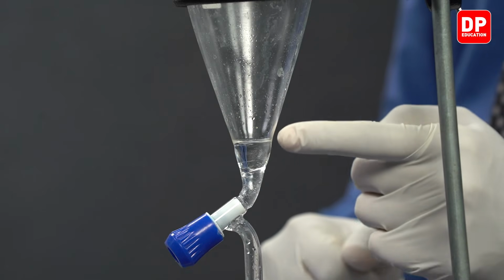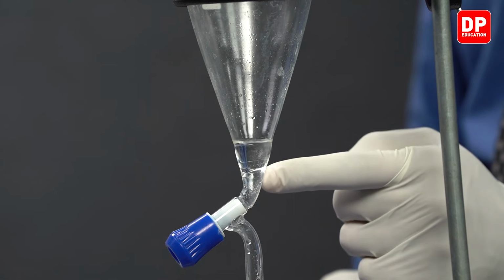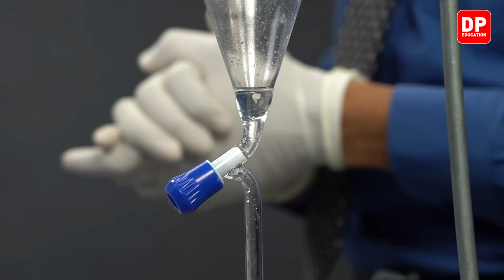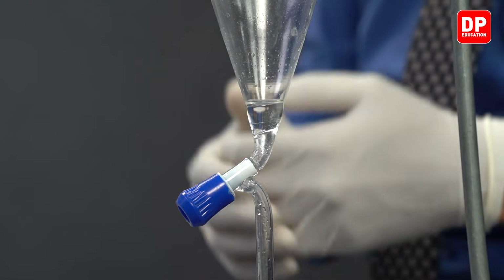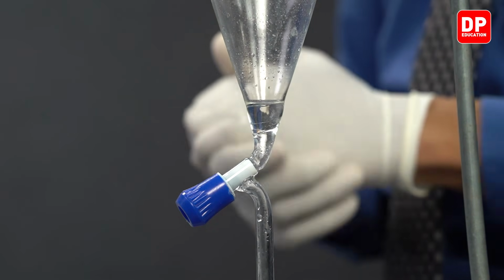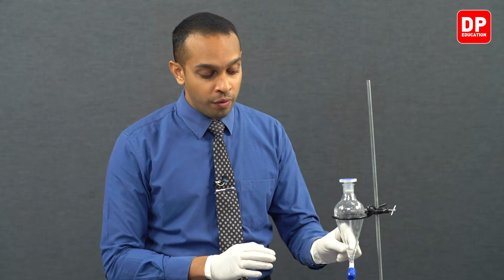So students, as you can see, the diethyl ether layer is up on top here and the aqueous layer is in the lower parts over here. Diethyl ether has a lower density than water, so it is going to be present on the top parts of this mixture. It doesn't mix well with water, so that's why they separate out into two separate layers. And since diethyl ether has a lower density, it is going to be found on the top layer in this mixture.